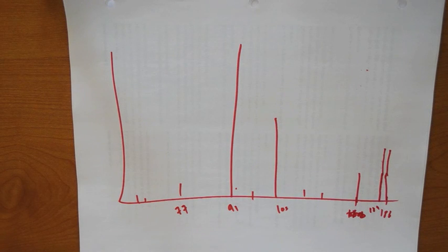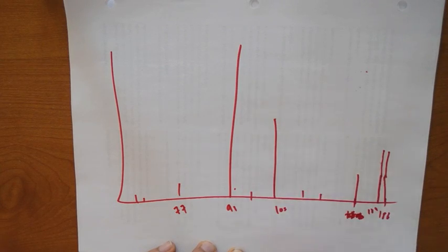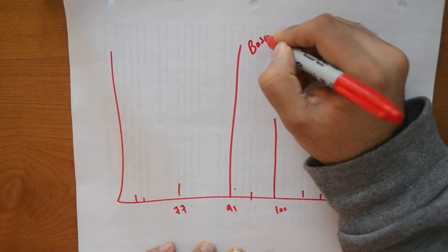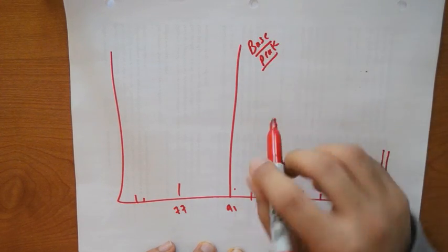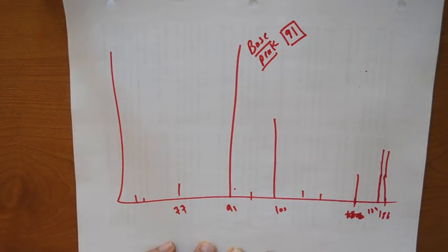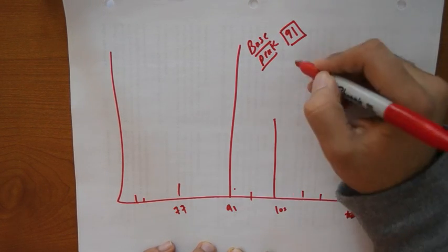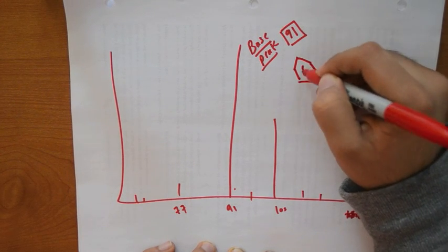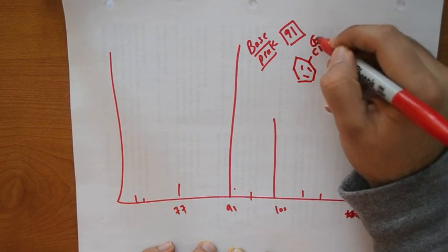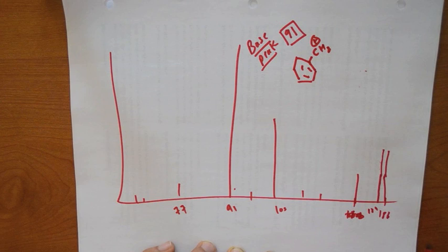Okay, so this is your typical mass spec spectrum. It won't be as badly drawn, but this is what it will look like. So first things first, we look at your highest peak, which is, what's it called? Base peak, good. So which is right here. Now, if you have your base peak here, which is at 91, what was significant about 91? Why would it be the largest peak? What was there? Think about it. Okay, so if you thought about it, you're right. It should be a very stable structure because it's so large, and you have benzylic, which is nicely stabilized by resonance.